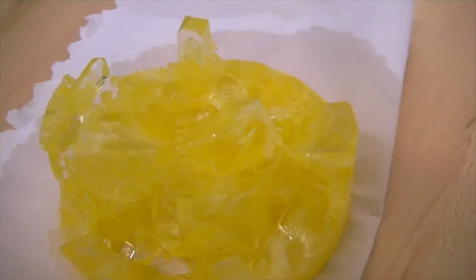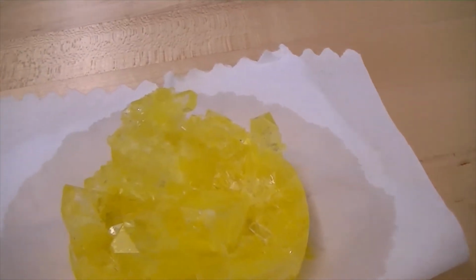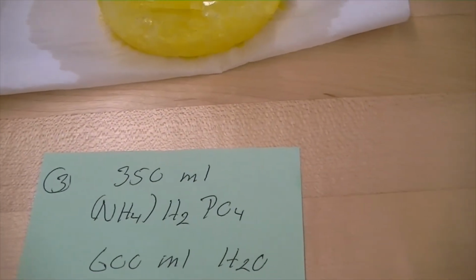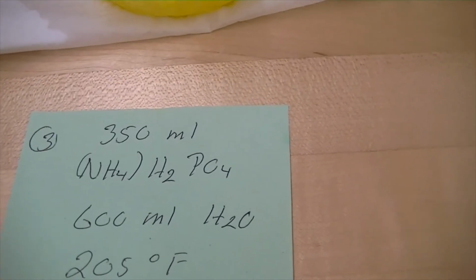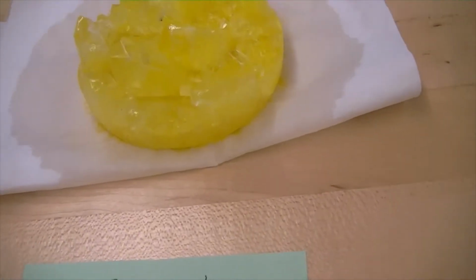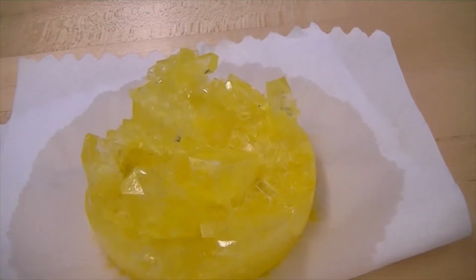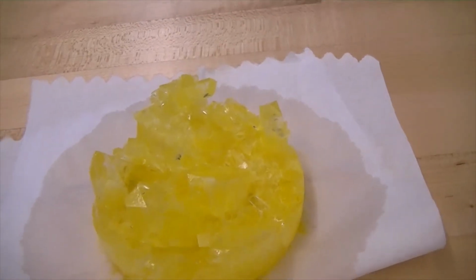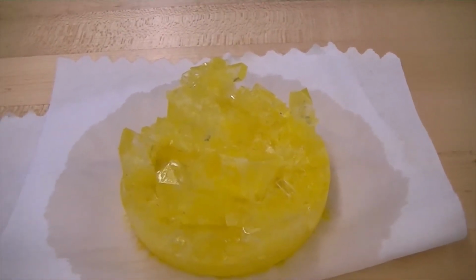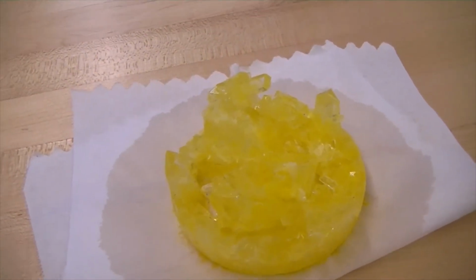And something that we kind of discovered here is it seems like if you wanted to grow large crystals, then a solution that contained 350 milliliters would have been that optimal solution for growing large crystals. So this is something we learned. It was not part of our hypothesis. Nobody came up with a hypothesis that there would be an ultimate precipitate concentration that would grow very large crystals. That's something we learned in this process.